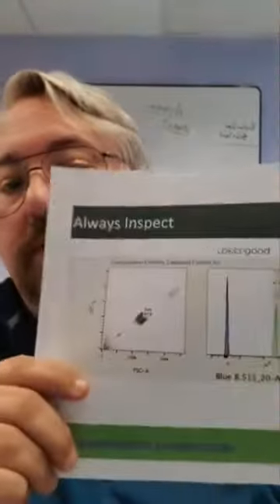The second thing we wanted to talk about, we highlighted, was the whole compensation. FlowJo has a compensation wizard, and when you bring data into the FlowJo package, it will automatically look for files that it thinks are compensation and put them in a compensation sample, and then you can do automatic compensation.